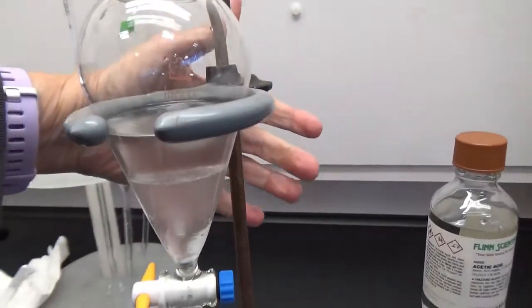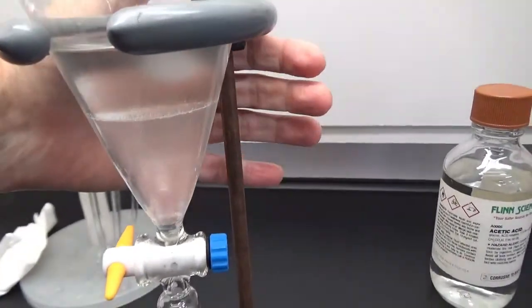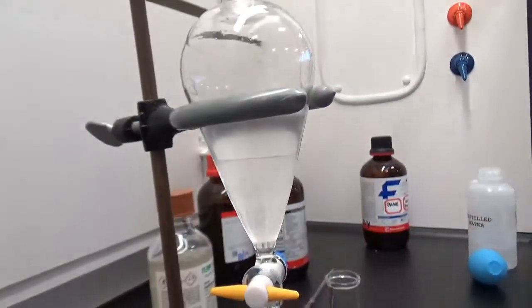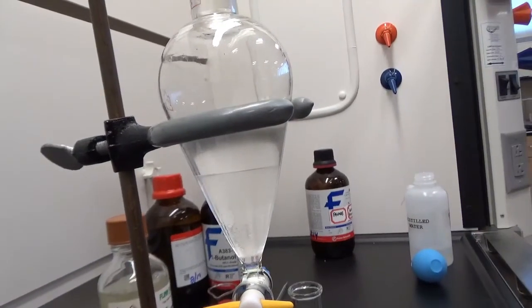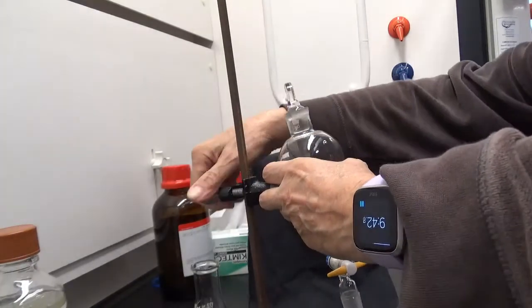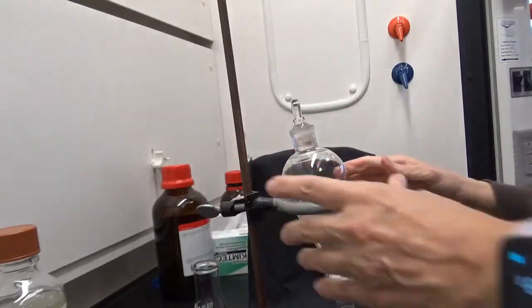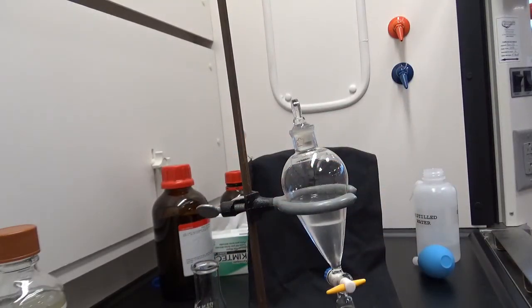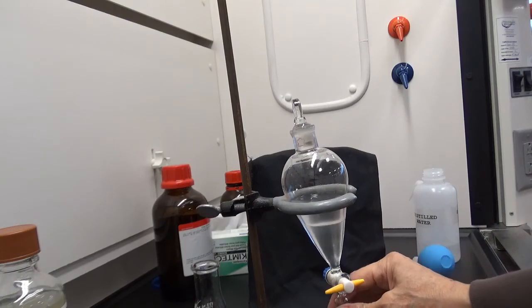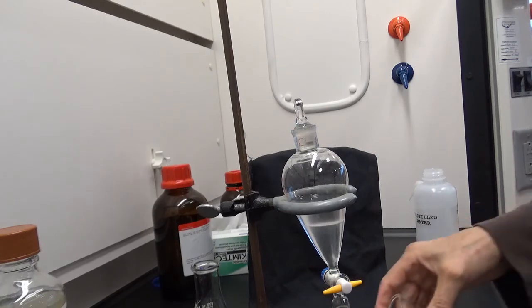The white background's a little hard to see, but there you can see there's a line there now. Okay, so I'm just going to let it separate a little bit longer. Well, at least you can see the line now, the separation line. All right, let me get the lower layer beaker here.